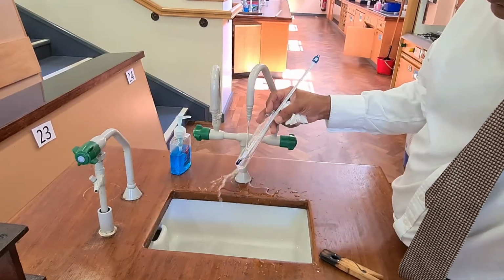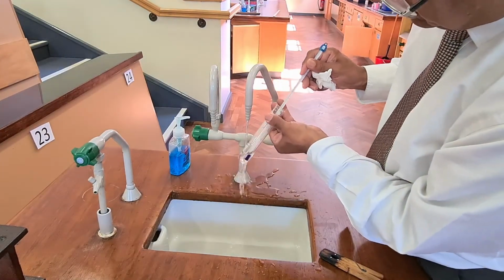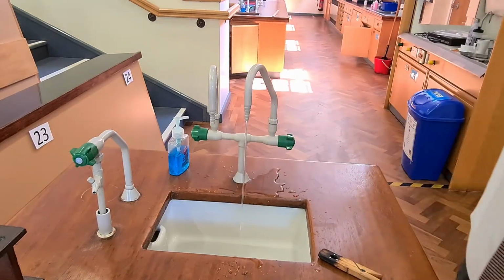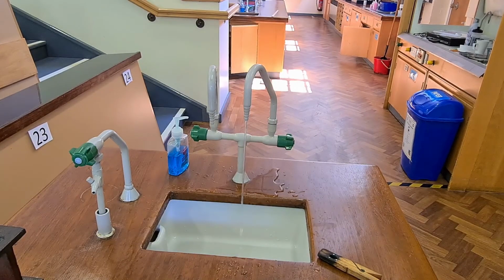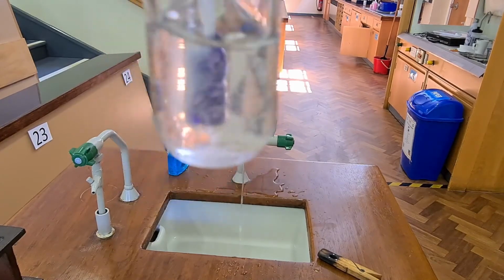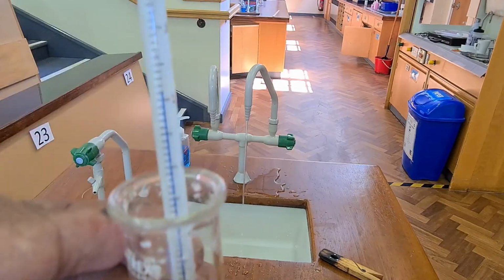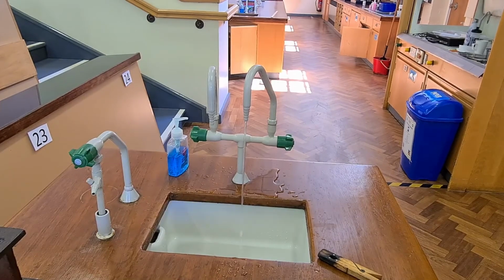When the temperature inside is cold enough and the solubility is exceeded, then the extra solute will come out, and it will come out as crystals in a process called crystallization. There. Now it's starting. Can you see the crystals? Right, that's crystallization. So, what's the temperature? Well, temperature is 22 degrees. See that? 22 degrees.